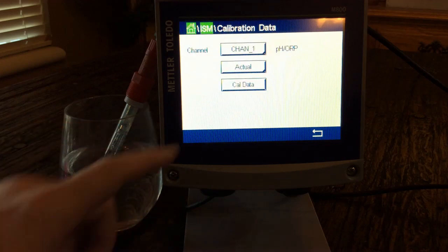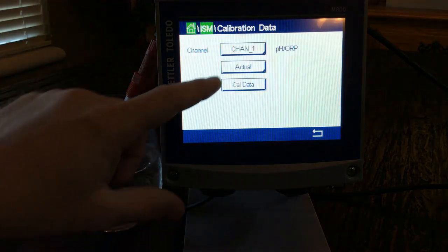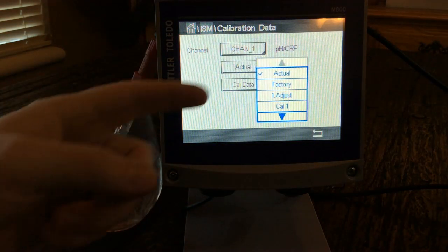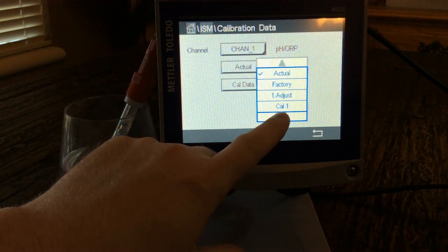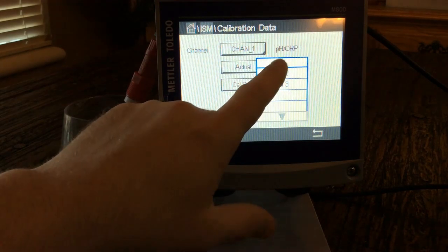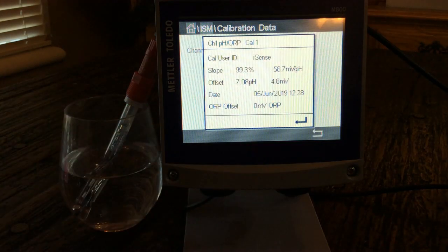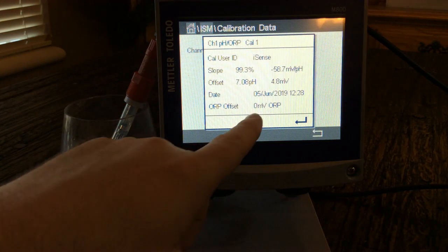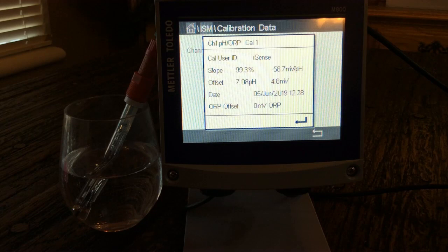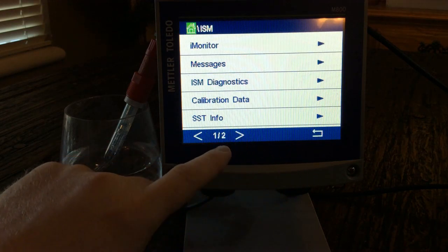Under Calibration Data, you can pick whatever channel you want and see your actual readings, factory values, and your adjustment. Depending on how many calibrations you've done, you can see up to three at any time. For example, Cal number one done June 5th of 2019 shows our slope and offset. It saves the last three calibrations.